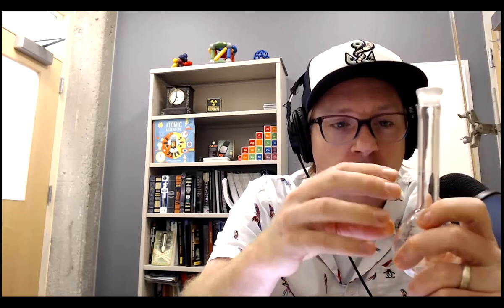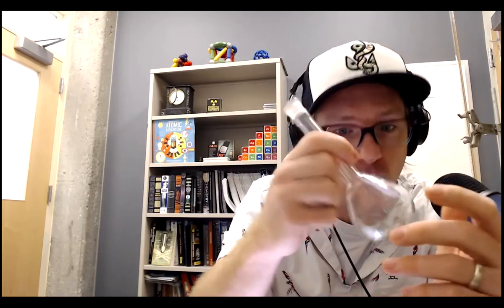It's okay if it starts wet. You're adding a bunch of water anyway. You want to rinse it out really, really good. You don't want any of those iron atoms left over. And then you have to go reweigh it, write down that number, add it, add water, mix it up, add more water, mix it up, add more, mix it up till it's completely mixed.